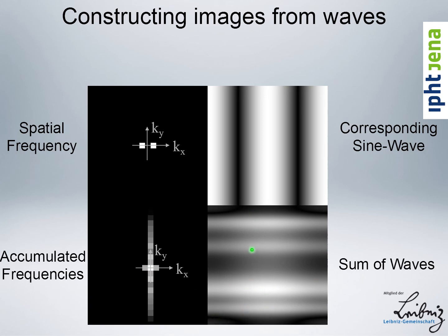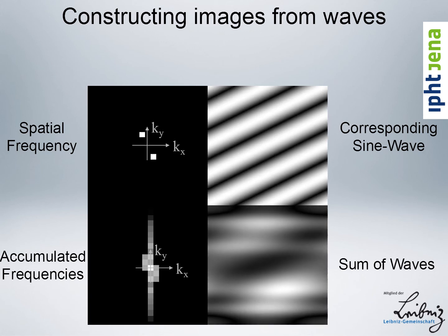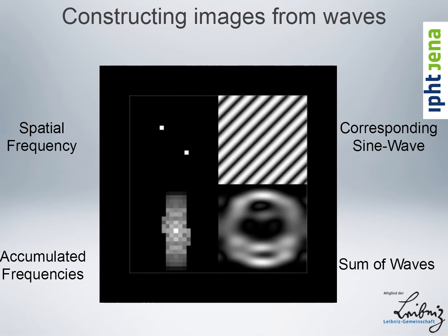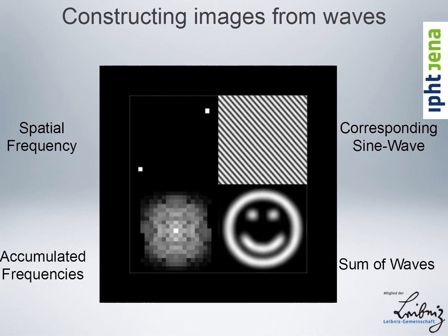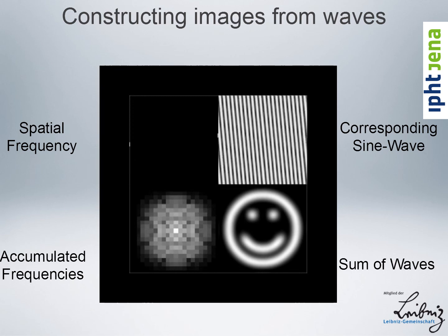So the first oscillation being negative, positive, negative here is also shown, and so on. We add diagonal 1, and now you will see a video in a second that by adding all the components, you're starting to actually reconstruct an image. You see how more and more of a feature can emerge. You start to see a smiley face here, and when we filled all the frequencies, we've actually represented our image up to that maximum possible frequency, which interestingly would be the diagonal frequency up to the corner here, the highest frequencies we can. We get our smiley face.